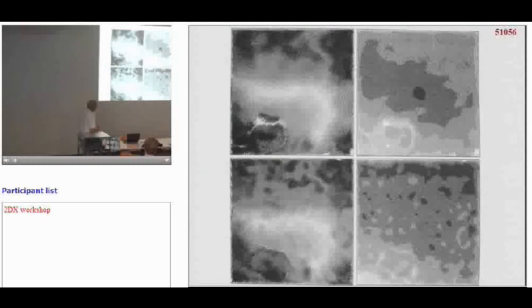And how does it look in the unbending? So here is this top right-hand panel. Again, we've picked a little bit in the middle of the crystal as the reference area and used that to unbend the whole thing. And this is the peak height. Of course, at the beginning, this has got a certain defocus and so on that we don't really know. It agrees best with the bit of the image near it and at the same defocus level. And as you go nearer focus and further from focus, some of the Fourier components are not right, so you get lower correlation. But it's enough to get started, and these are the distortions.